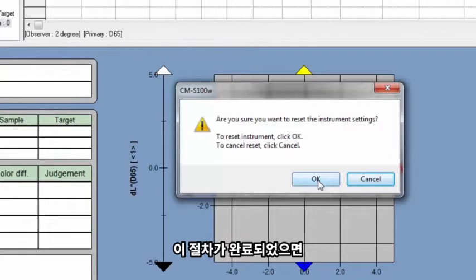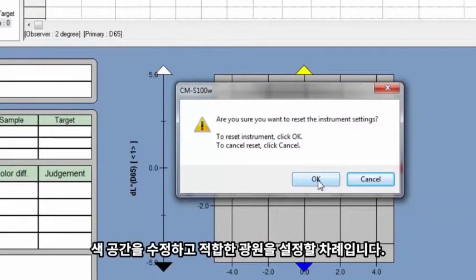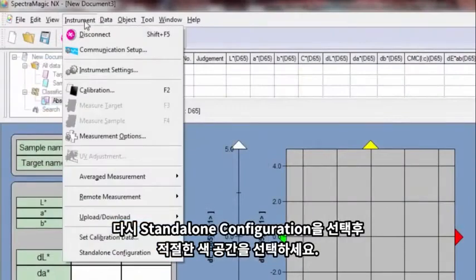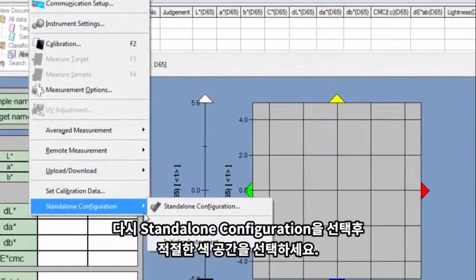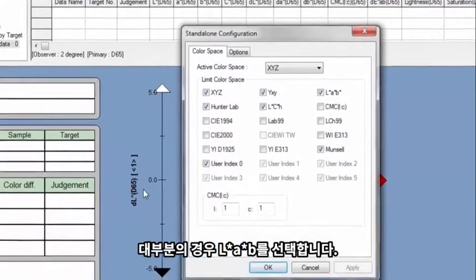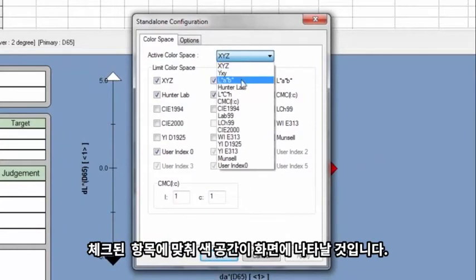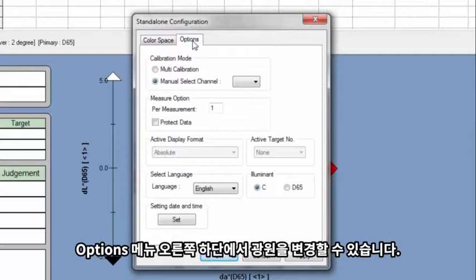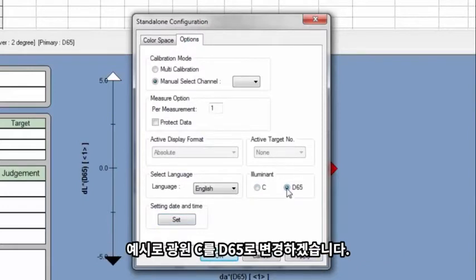After the instrument is connected and initialized, it is time to edit the color space and set the proper illuminant. Go back to Standalone Configuration and choose the correct color space. In most cases, it will be LAB. When you check the box, the chosen color space will appear on the instrument's screen. Under Options, towards the bottom right of the window, you can change the illuminant. In this case, we'll change the illuminant from C to D65.